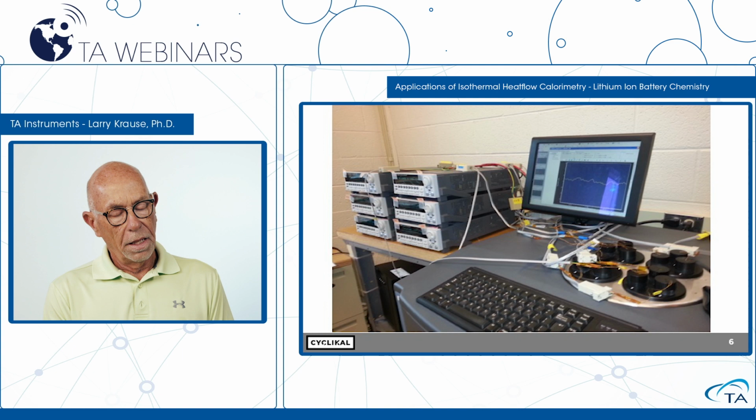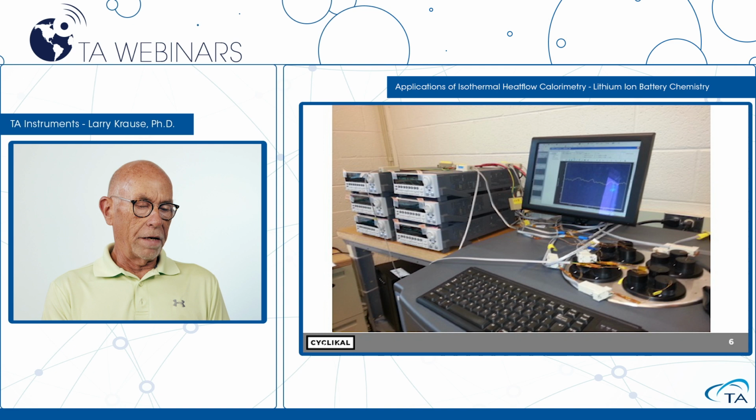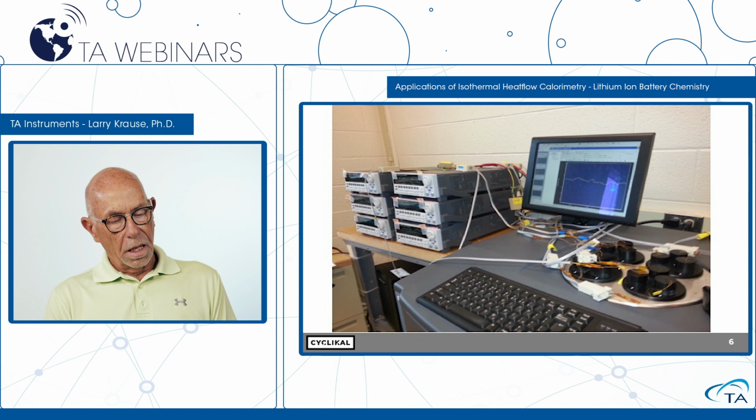And what we always do in this is we apply electrochemical measurements to the cells that we're measuring. And to do that, we use highly precise Keithley 2602A current volt source meters, which are over here. We have six of these just driving the TAM. And each one of these has two channels, so we have a total of 12 cells that we can cycle simultaneously or do electrochemical measurements simultaneously. So that's what the TAM looks like.